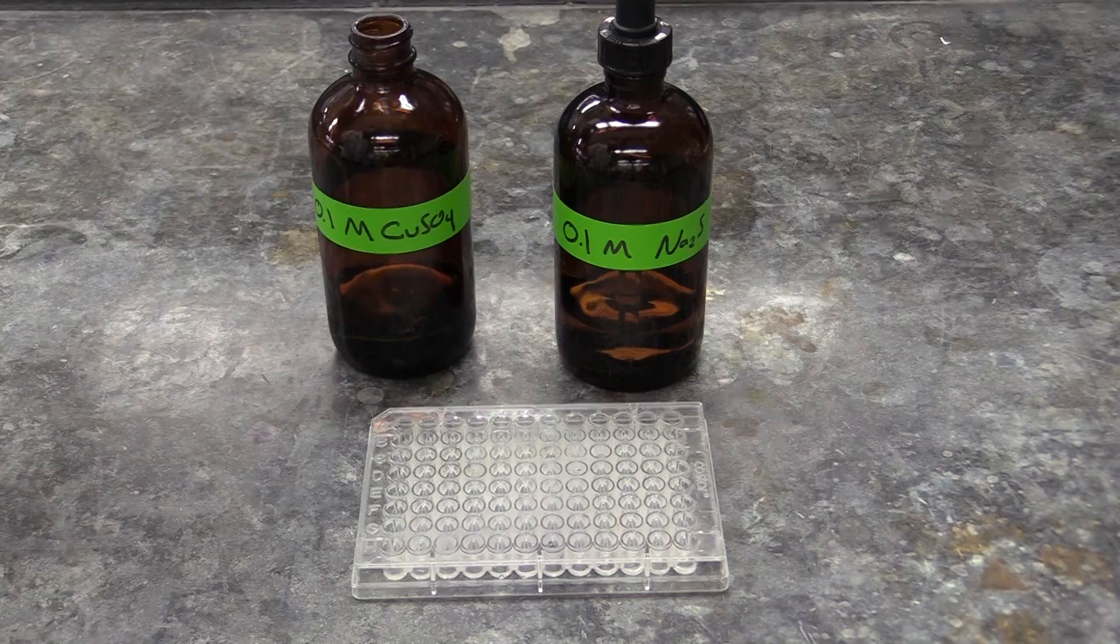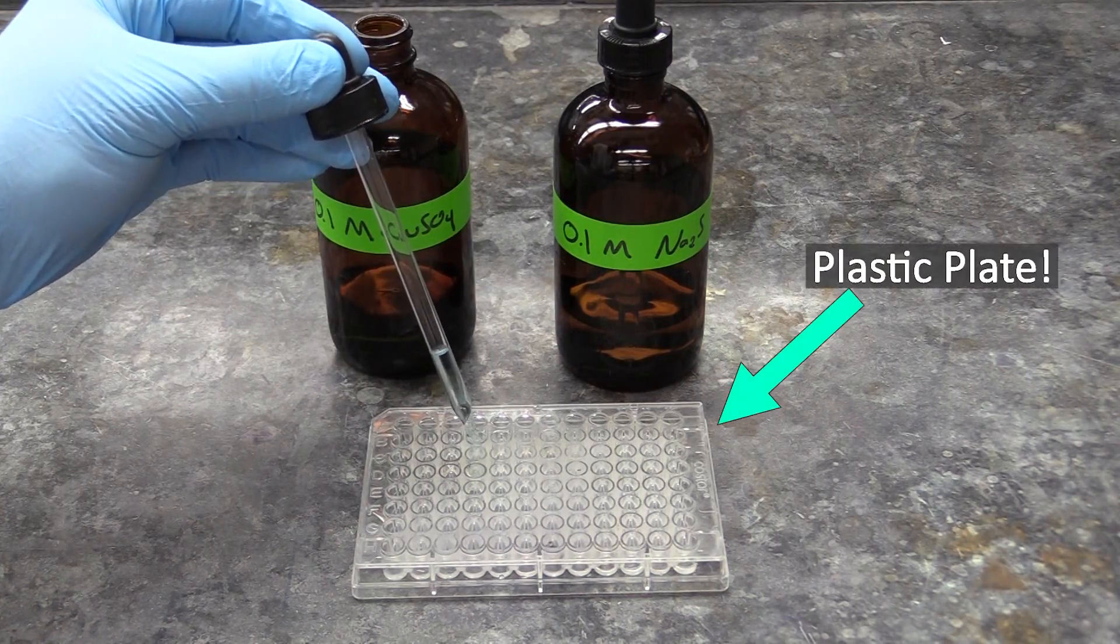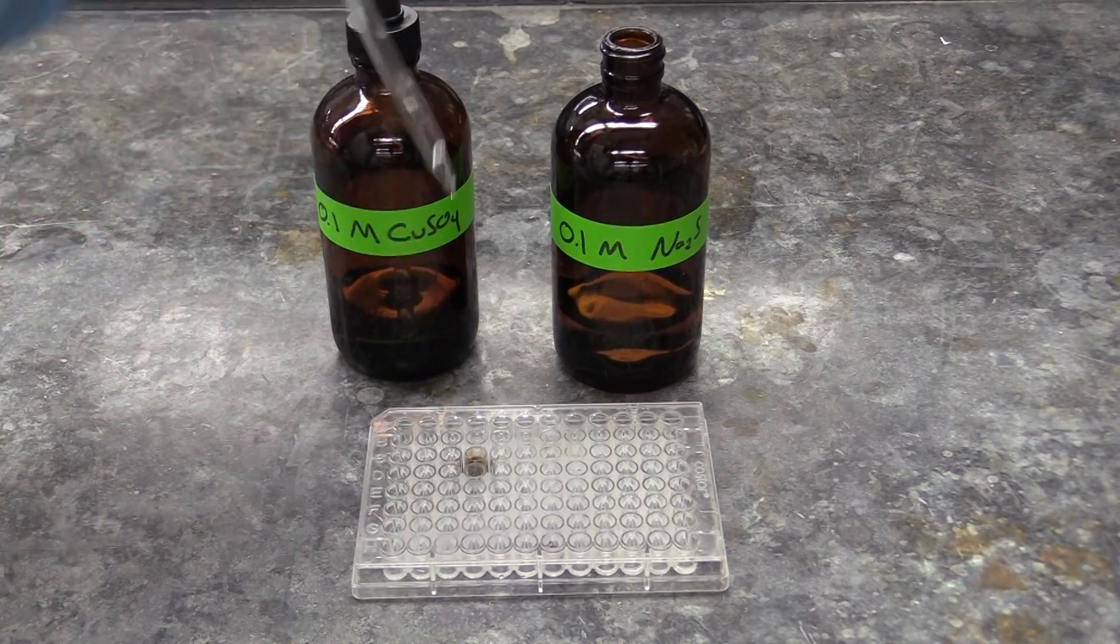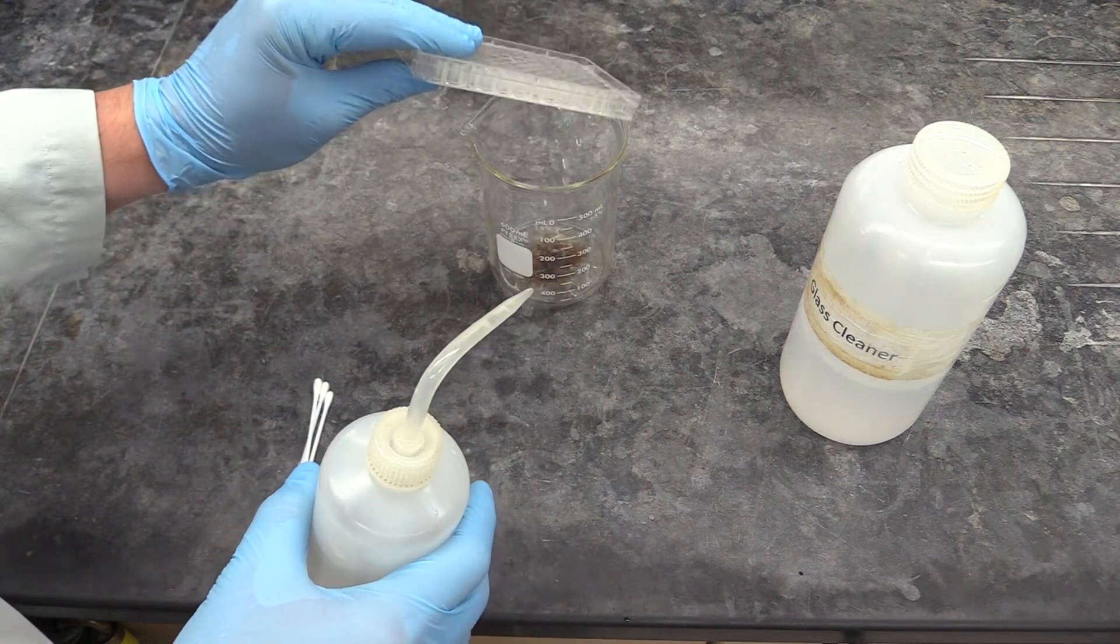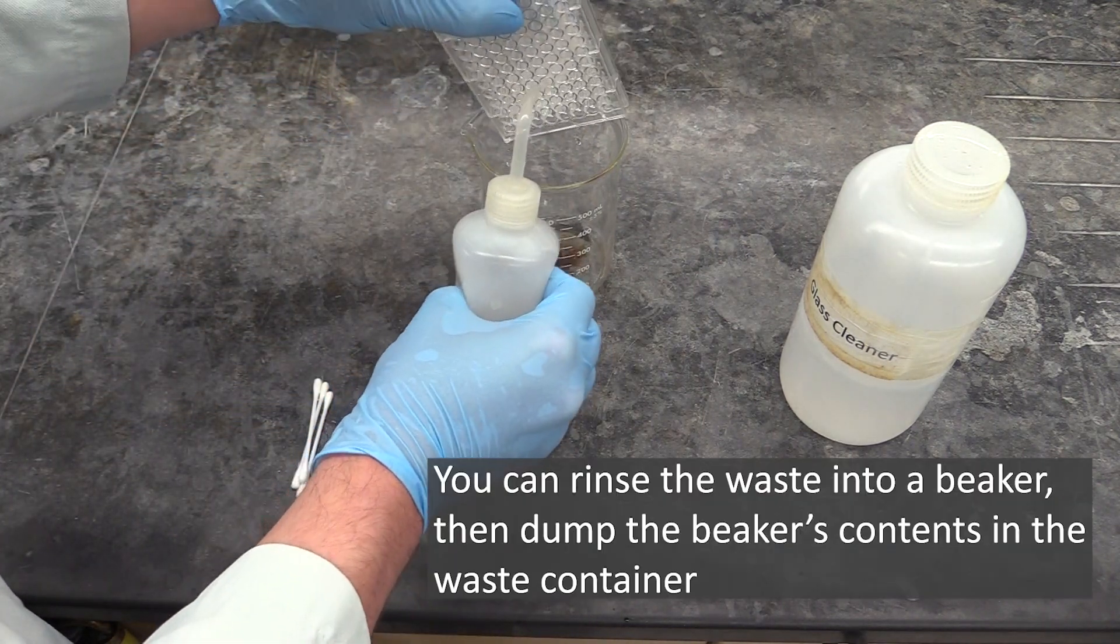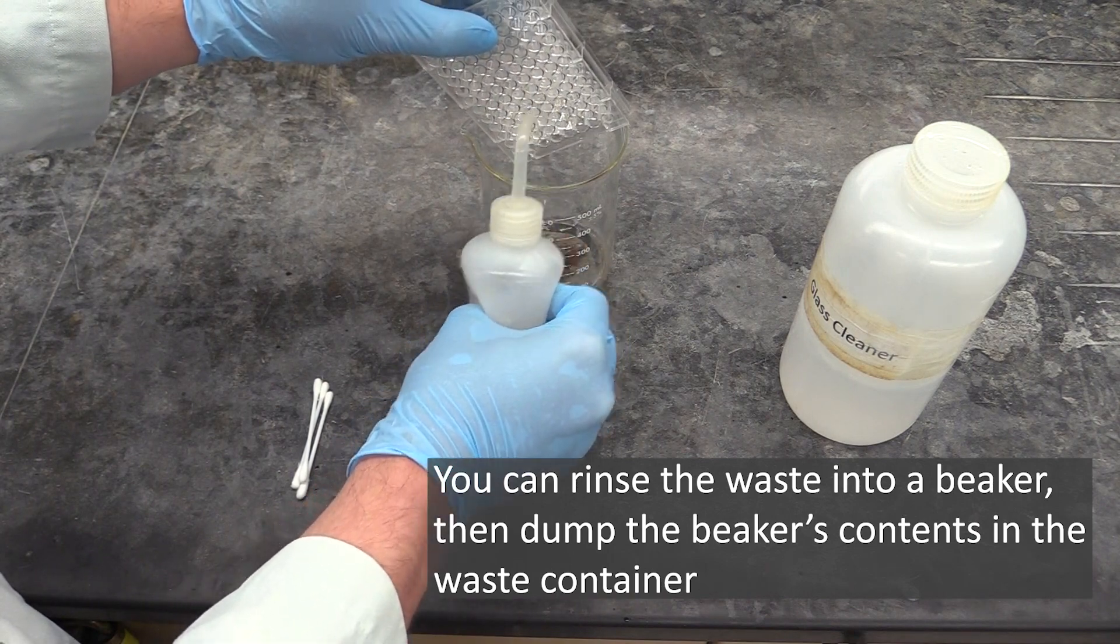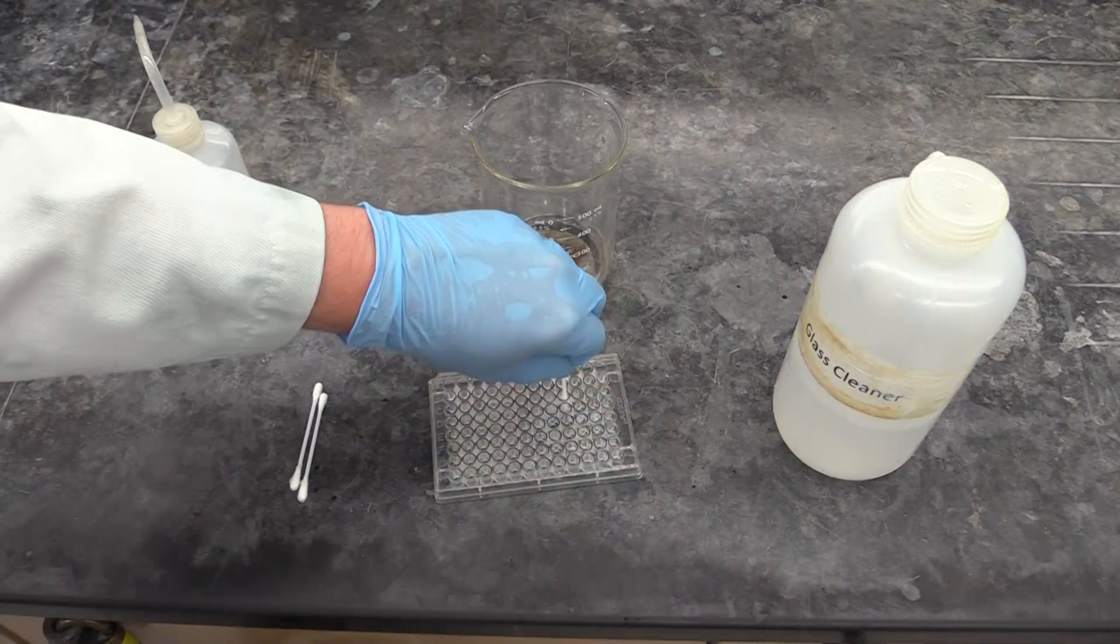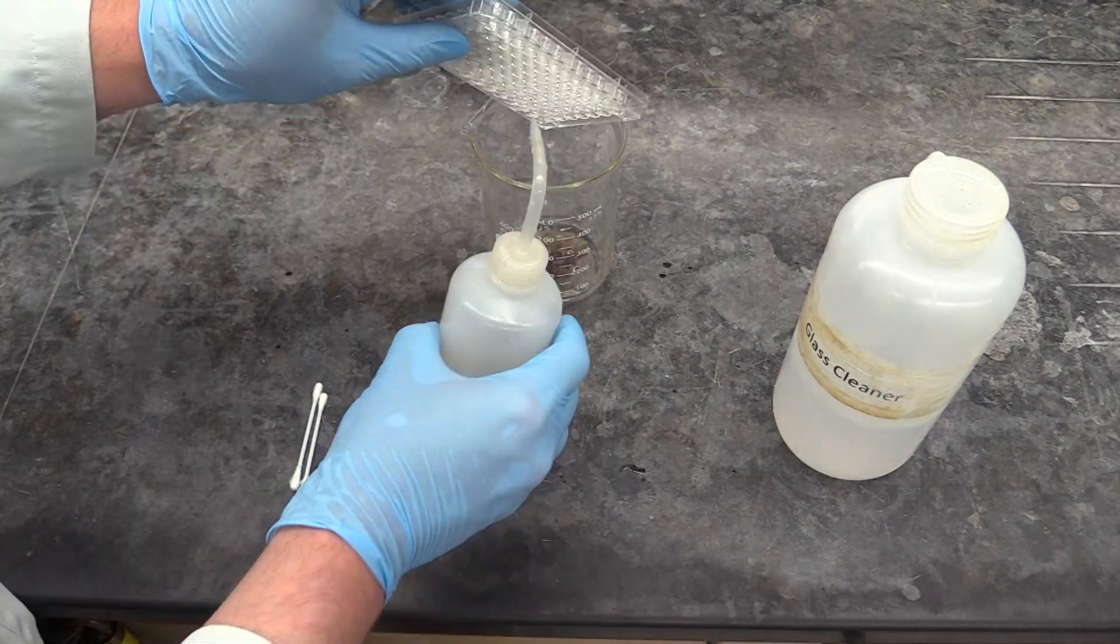For the precipitation experiment itself, you'll mix the soluble solutions together in a plastic plate. This plate has small wells, so you'll only need to use two or three drops of each solution. When you're done, dispose of the solutions you added to the plate in the lab room's waste container, then add some glass cleaner to the wells, scrub them out, and rinse it thoroughly.